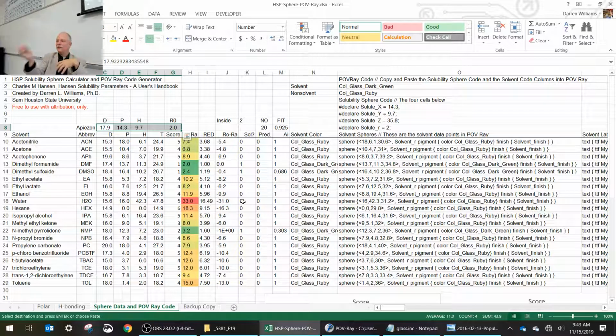It's not as toxic as the other one. It's not as environmentally damaging as the other one. It interacts well, maybe not the best, but you can rank the different features and come up with this desirability rating, and you can really see it with the conditional formatting. And then you can do some tricks like we did with this fit function, where 1 is good, 0 is bad, and you can multiply things by each other and get this overall sort of not necessarily risk assessment, but desirability rating, and pick the best solvent for your situation. So I think that's a useful skill to know.